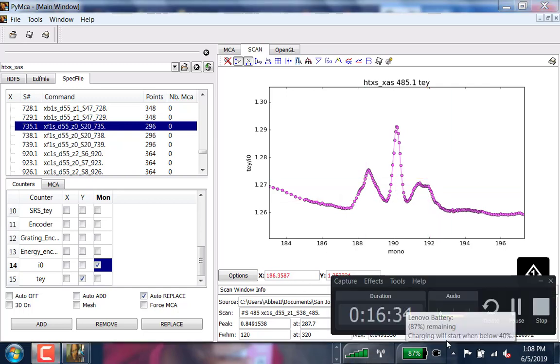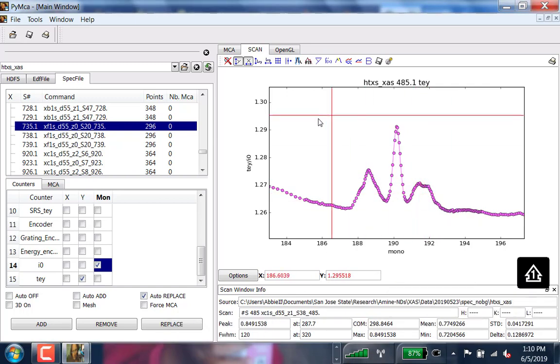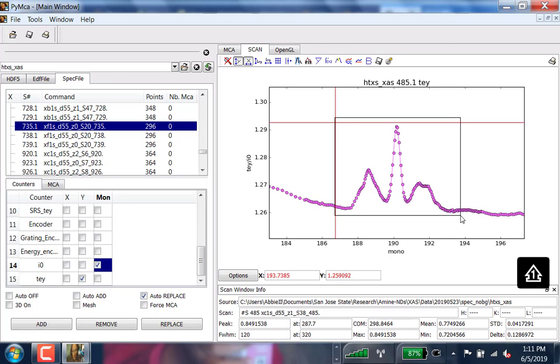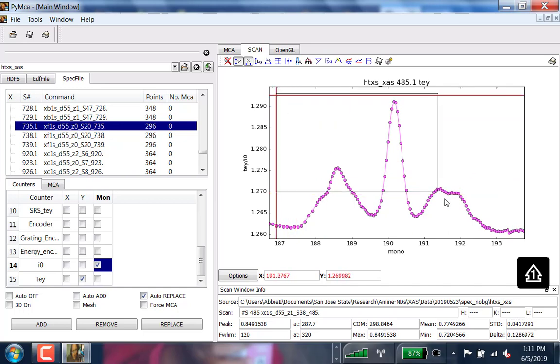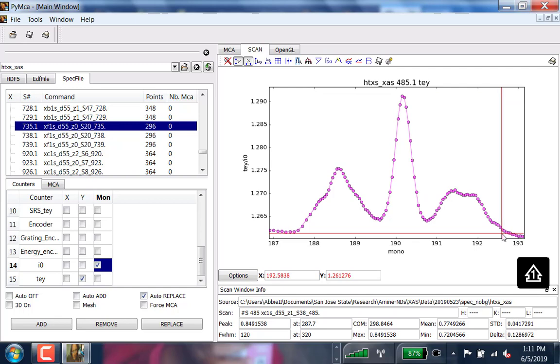Okay, so we come back to our boron scan right here. Overall, we've got these features which should correlate to the bonding environment. And as you get closer and closer, you'll see that my estimate of 5 peaks is wrong. And this is what we would do in Igor.